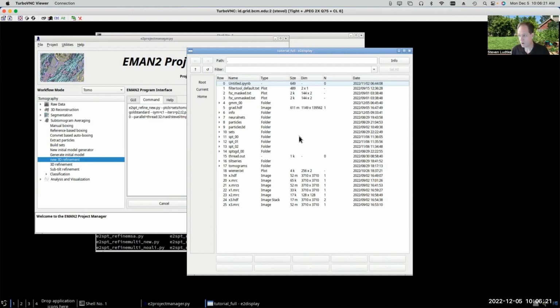Now you'd say, what about dose weighting? Can't I compensate for that with dose weighting? Well, no, not really. When you're doing single particle analysis, you can use dose weighting, so the higher dose particles are only contributing at very low resolution. But the high dose particles in tomography are also the high tilt particles in general data collection strategies, which basically means that the high tilt particles are only contributing at very low resolution, which makes them virtually useless.